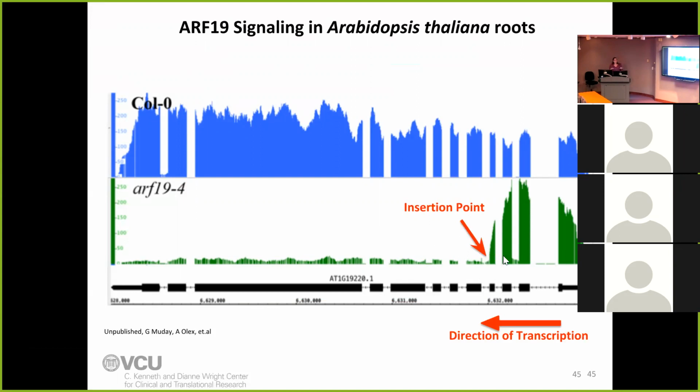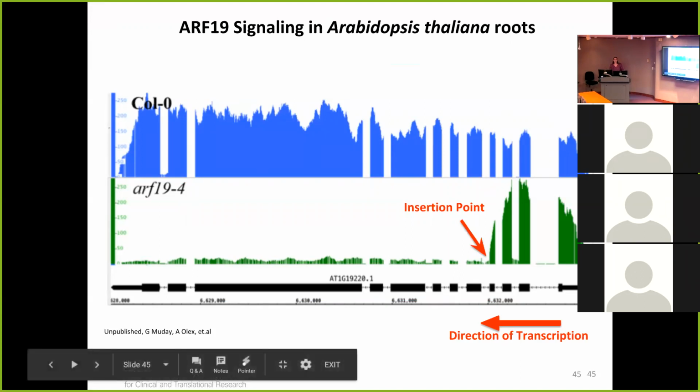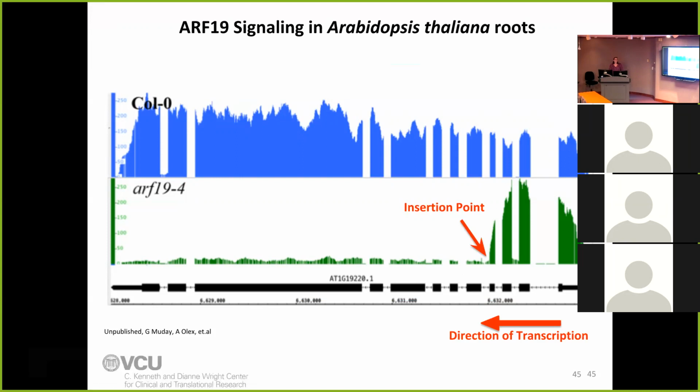So being able to pare down and dig deeper into RNA-seq data was able to tell us, hey, the knockout actually did work. This is not a functional transcript, so we're good. So we were able to continue with the experiment. If this had been microarray, it would have led to a bunch more investigation. Hey, did the knockout method actually work or not? But because we had RNA-seq data, we could actually look down into more detail to see that the knockout, yes, it did indeed work. This is just noise.